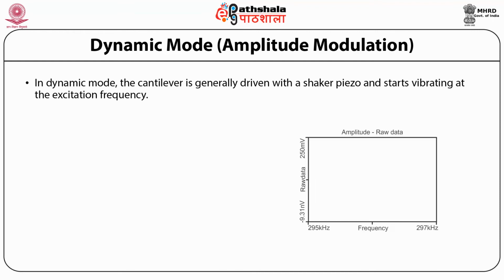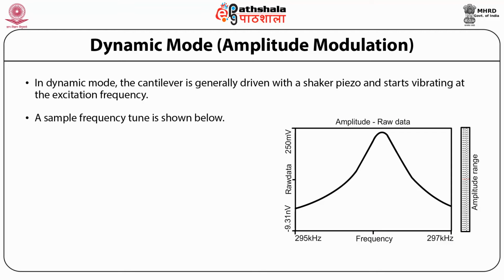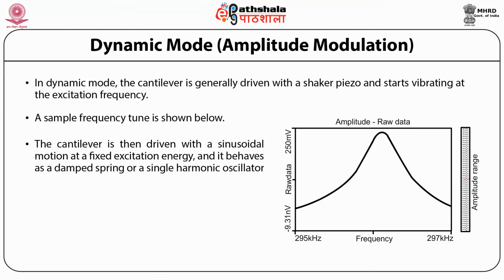In this mode, the cantilever is generally driven with a shaker piezo and starts vibrating at the excitation frequency. By sweeping the frequency across a suitable range, the peak in the frequency spectrum, as shown in this figure, which corresponds to the resonance frequency of the cantilever, can be found. The cantilever is then driven with a sinusoidal motion at a fixed excitation energy, and it behaves as a damped spring or single harmonic oscillator.